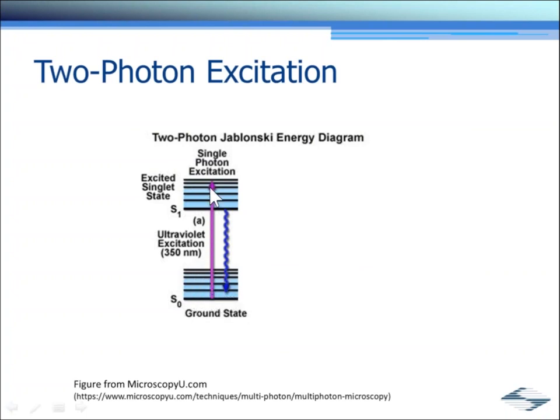However, this reddish purple arrow represents an incoming photon, an excitation photon, that knocks the fluor into the excited state. Once the fluor is in its excited state, as we all know from our physics lessons, that molecule wants to relax back down into the ground state. So it does so, it comes back down to the ground state, and it has to release the energy as it does so, and we get out a photon, an emission photon, and that's actually the photon that we're observing.